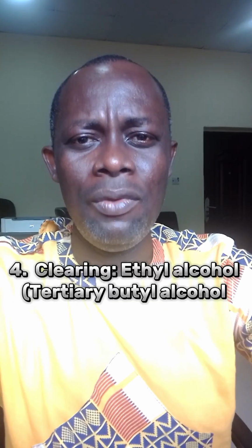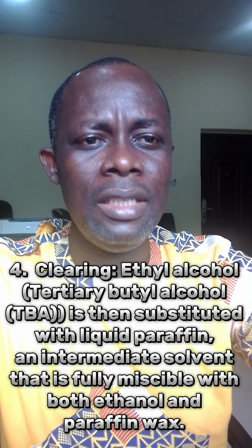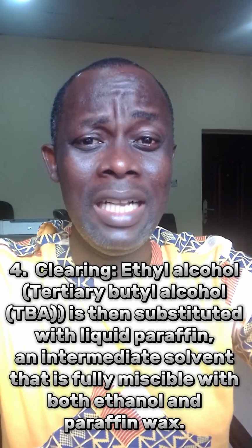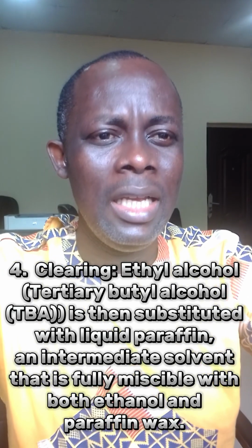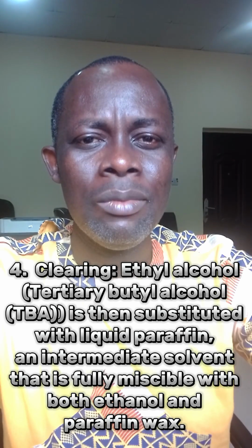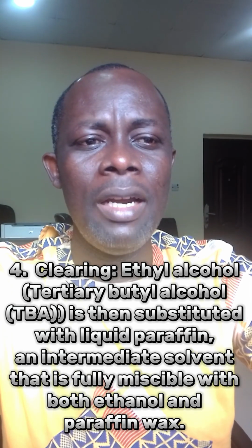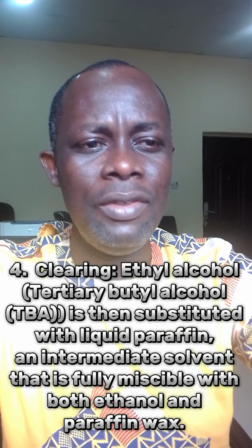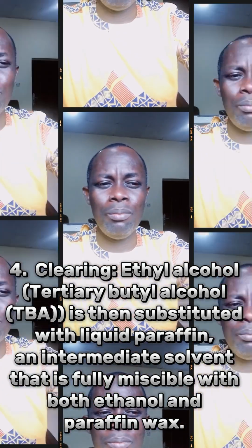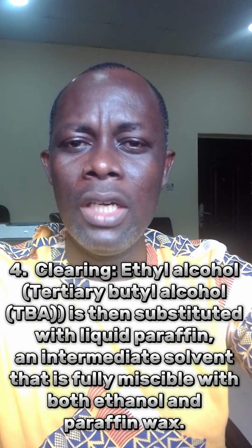Then we have the fourth step, which is clearing. In clearing, the ethyl alcohol is substituted with liquid paraffin, which is an intermediate solvent that is fully miscible with both alcohol and paraffin wax.